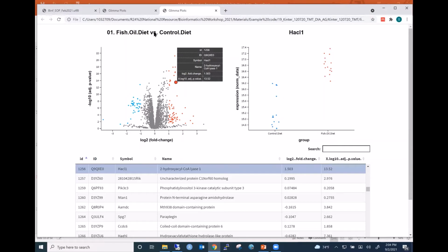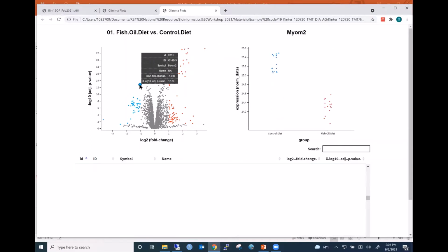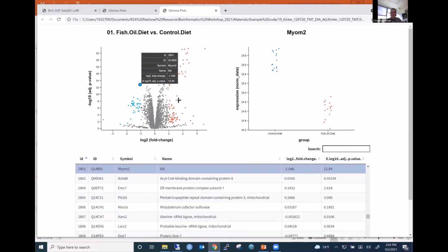Yeah, this is super helpful. Thank you for elaborating. Yeah, no, this is probably what we do in most of the consult meetings at the end of a project: spend some time here showing you how to interact with this data, find out more of those details so that we can ask those very things. How much confidence do we have in our fold change and our p-value?